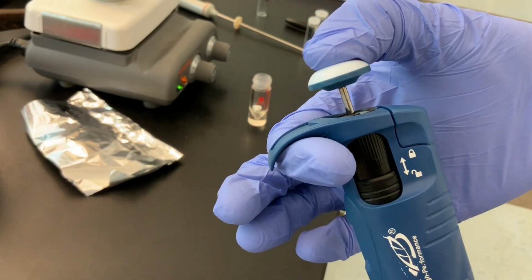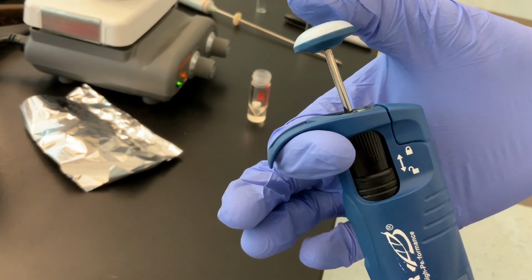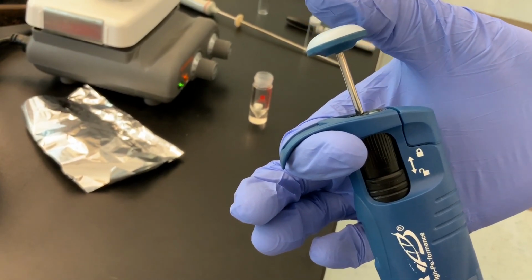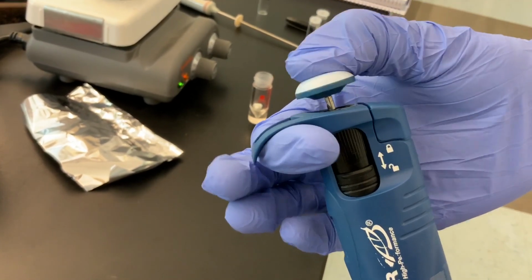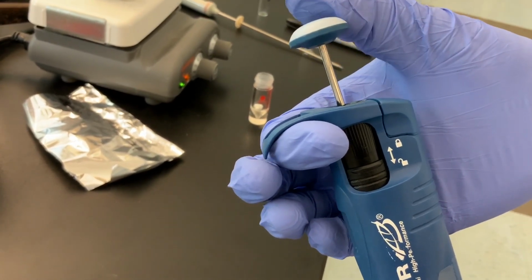So when we're going down to this level, this is where we're going to draw up the liquid, and we want to do it slowly to avoid grabbing it too quickly and capturing perhaps some air or just some vapors of whatever we're doing. And then the second level is how we're actually going to deliver the rest of the liquid.